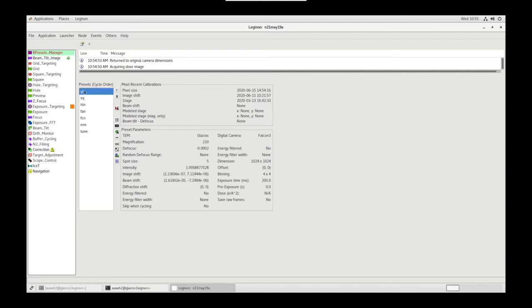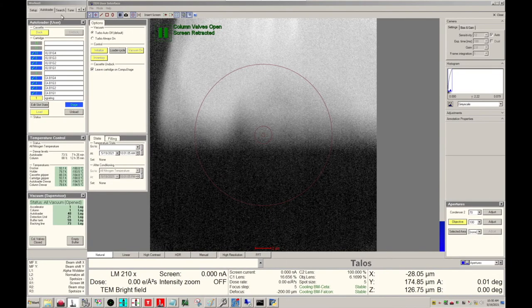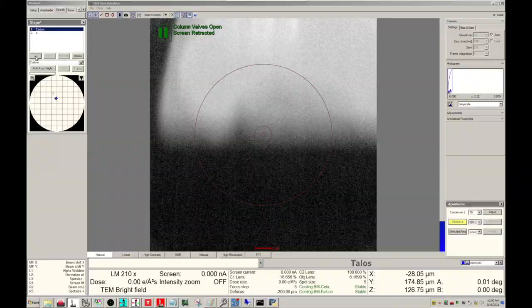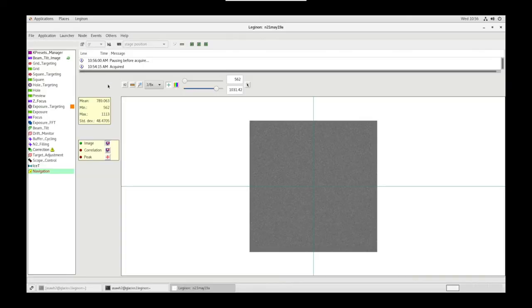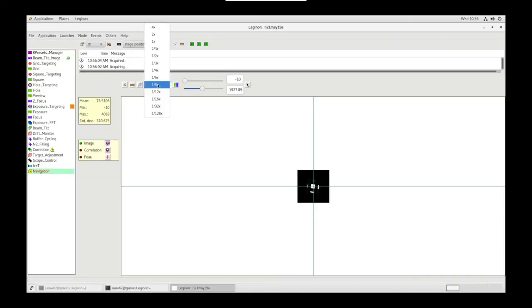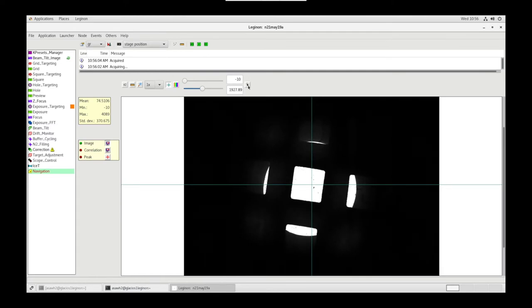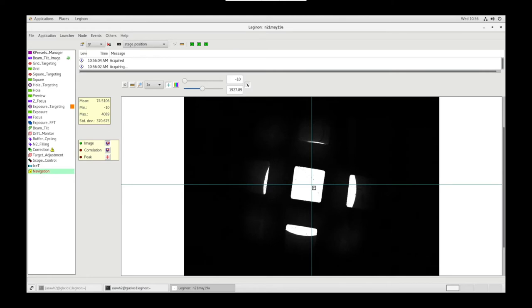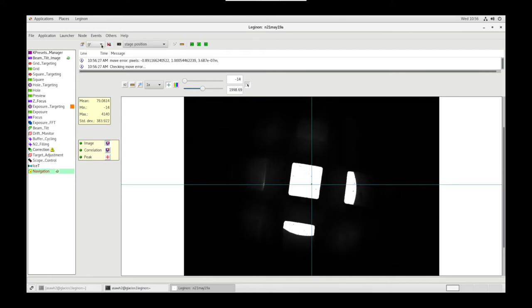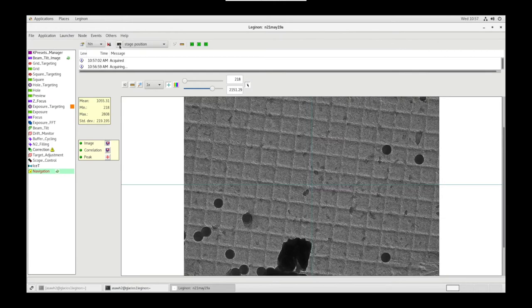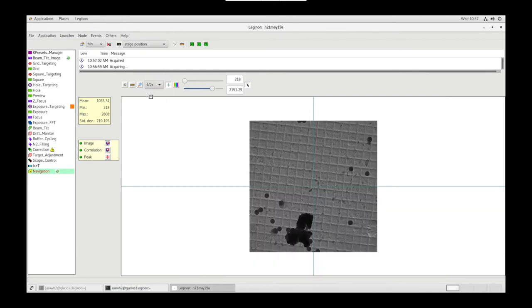Now let's do Preset Alignments. Let's send GRIN to Scope. On the Microscope PC, let's go to the Search tab and go back to Carbon. Using the Navigation tab, let's acquire an image at GRIN. Let's find an object of interest and go to that location using the Cursor tool. Let's go up in Magnification, send Hole, Acquire.